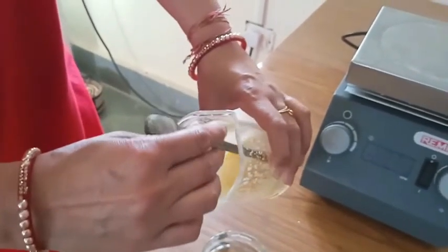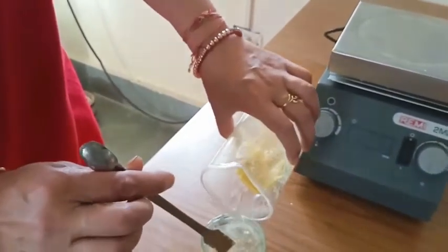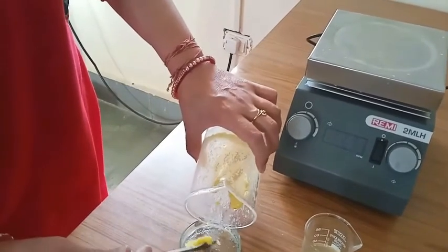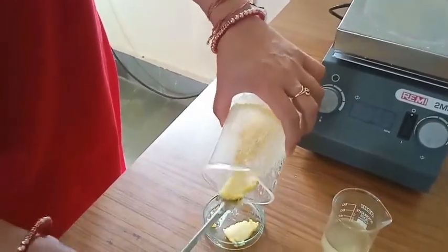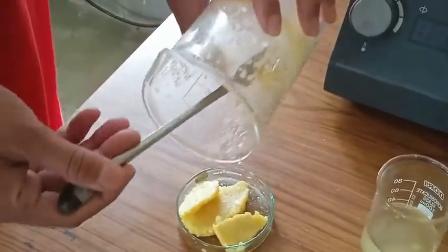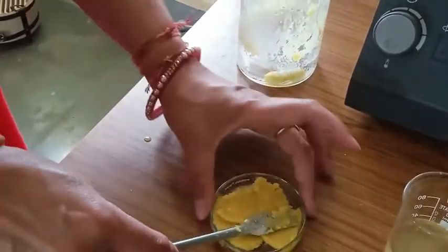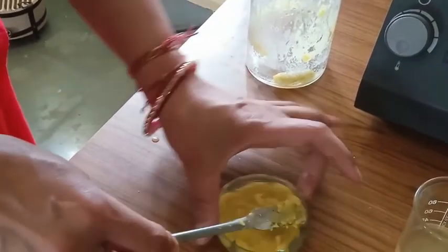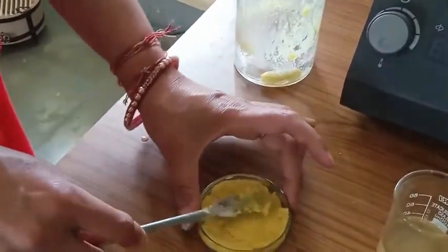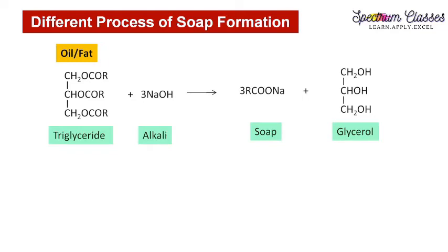Now we are removing the solution from this and transferring it into a petri dish or any mold. This is the cold process, because we have done this at room temperature, so it retains glycerol inside. This is how we can prepare soap.